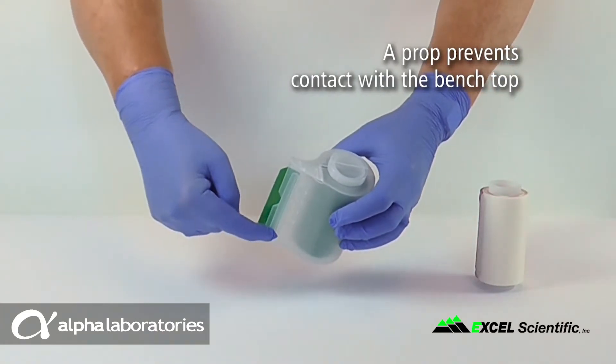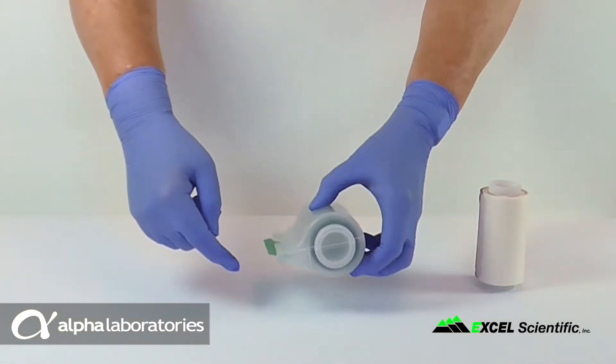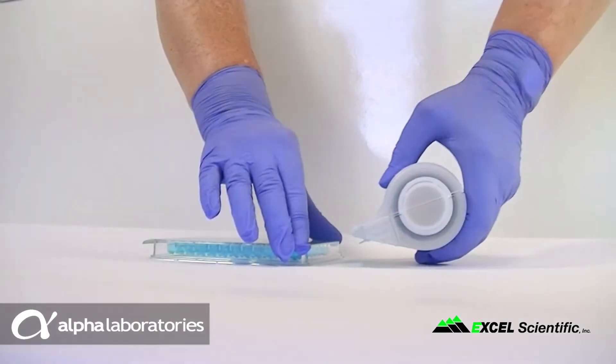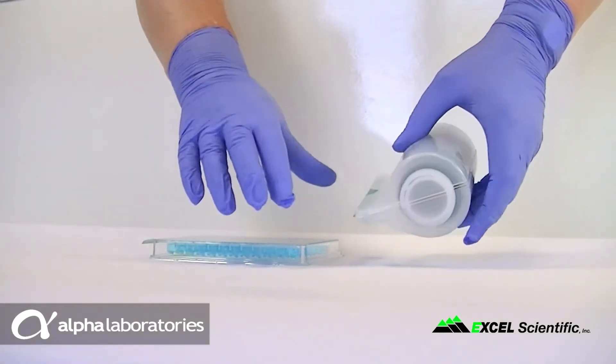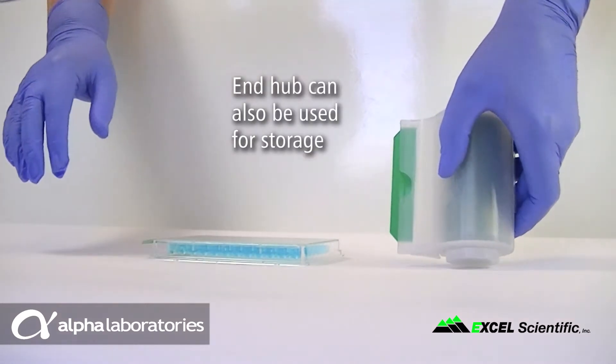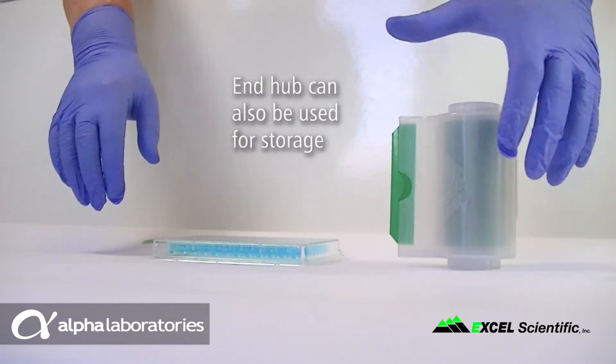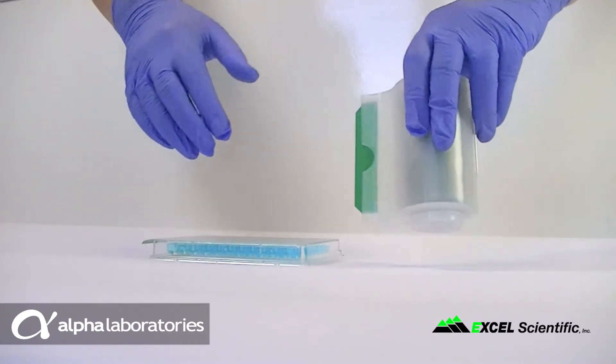A prop on the lower surface prevents the bill from contacting the benchtop when the dispenser is not in use. Alternatively, the dispenser can stand on one of the hubs at the roll ends during storage. The dispenser thus parked provides protection and keeps unused films handy for sealing subsequent plates.